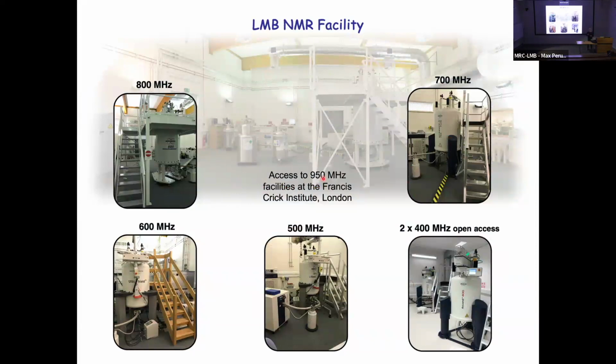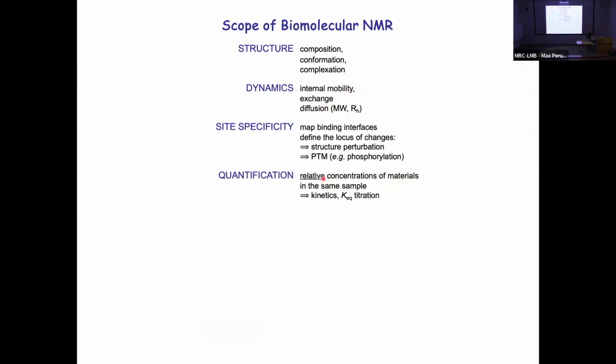staff. So your points of contact is either, if you have familiarity with NMR techniques, you can just come in and run the equipment yourself. You just need to speak to us to book some machine time. Otherwise, come and talk to us and we can help you plan, implement, and interpret the data in the context of your biological project. So what is it that you can achieve with all of this equipment? Why has LMB invested so heavily?